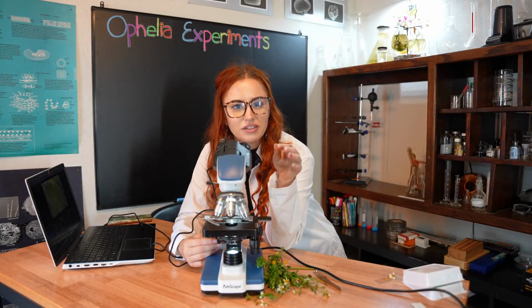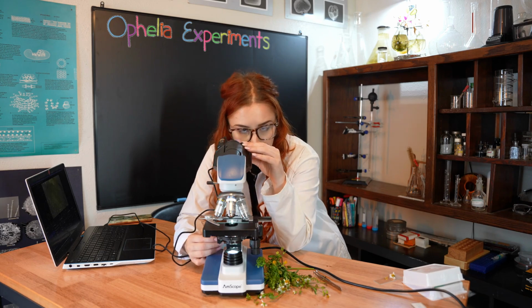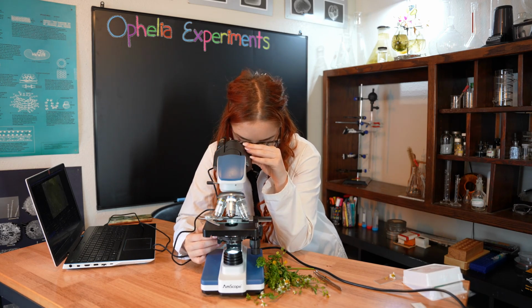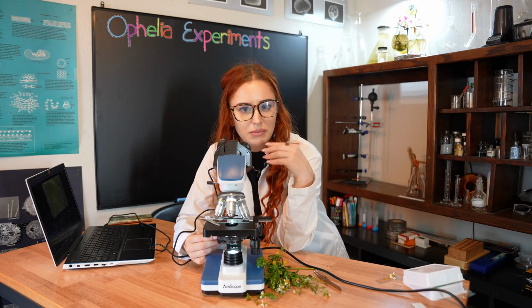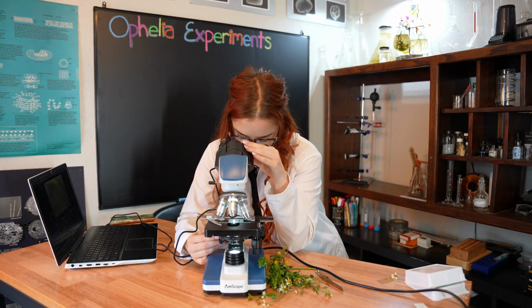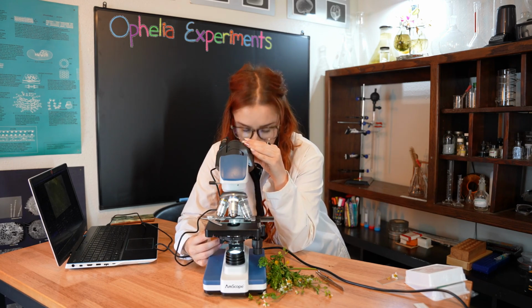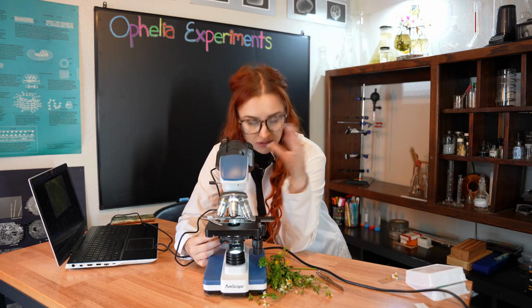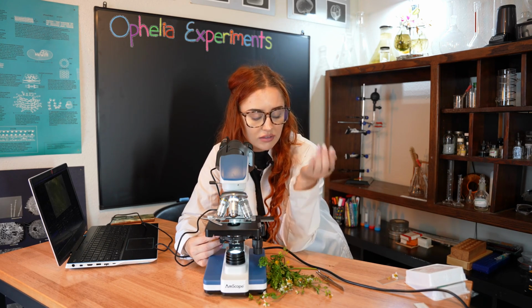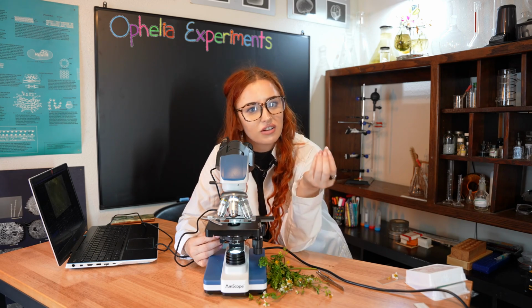So the first thing we're going to do is look at the cell structure of the wildflower petal. I'm just going to take a look under my microscope here. The cells of a wildflower petal can be particularly mesmerizing because you can see the mosaics and all the shapes and colors that are in these flower petals. It's truly amazing. These cells are often packed with vibrant colors. The petal we're looking at today is white, but colors are often used to attract pollinators.